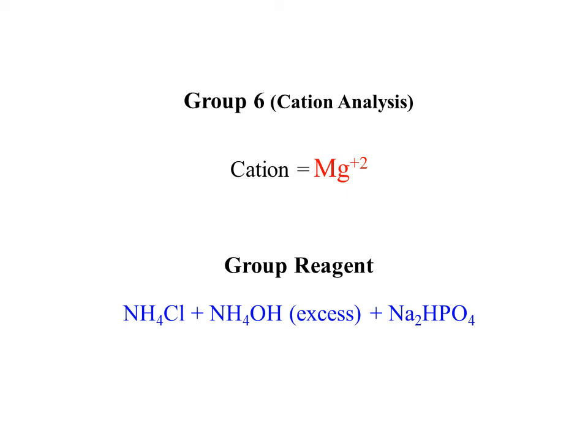We are not going to reverse the pattern, so NH4OH shouldn't be added first. The sequence needs to be maintained, otherwise experimental errors can pop up. So we need to memorize these reagents, and when we do the practicals, add them accordingly, sequence-wise.